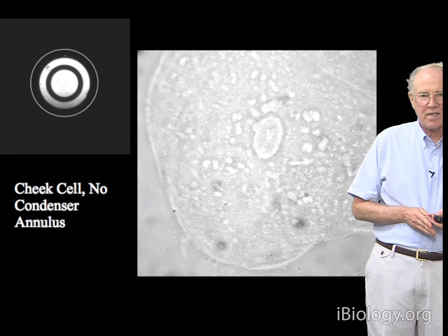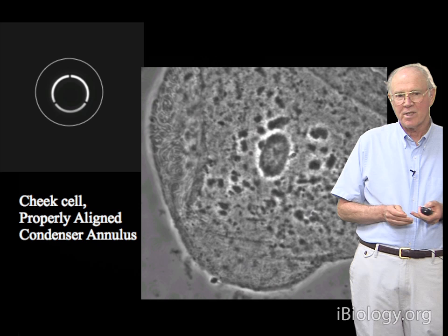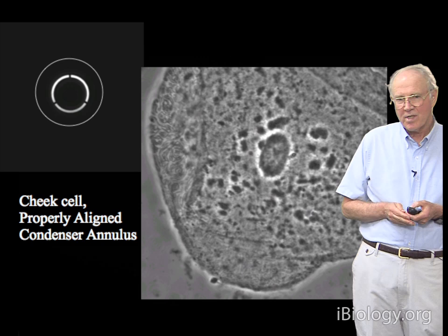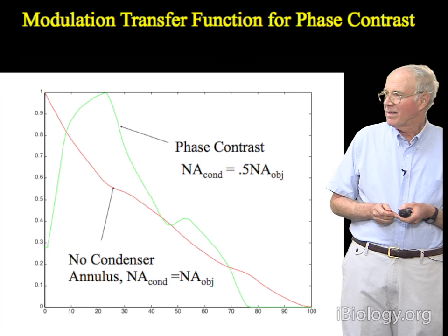Here we have no phase annulus at all, which gives our bright field image. Here we have a misaligned annulus, producing an ugly picture. And now we have an aligned annulus and we get a really nice picture. Once you get phase contrast lined up on the microscope, you usually don't have to ever change the alignment — you just simply switch the objectives and switch the turrets, making sure that everything is lined up and matched.